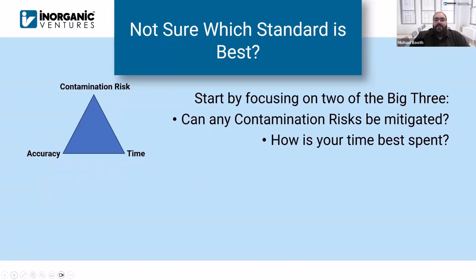Is there anything you can do to decrease the risk of contamination if you're worried about it? And then if there is anything, when you think about the time savings, or the time part of selecting the best standard, I always just like to tell people, what is the best use of your time? Typically, when folks get in the lab, it's really good for them to get experience in making standards. But if you've been making the same set of standards for years on end, there's typically better uses for your time than that, and it allows you to get more done throughout the day.